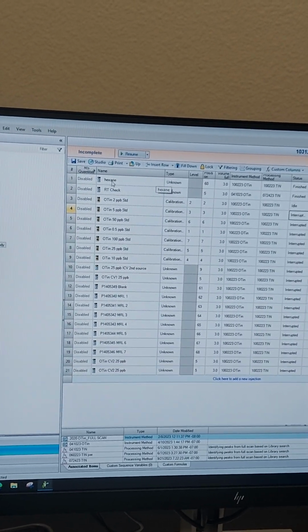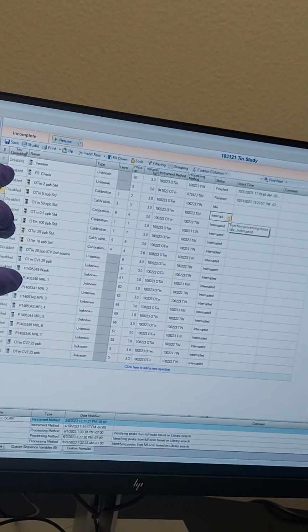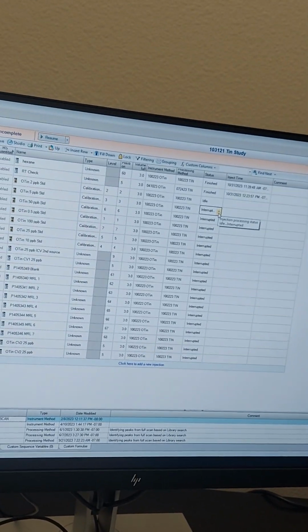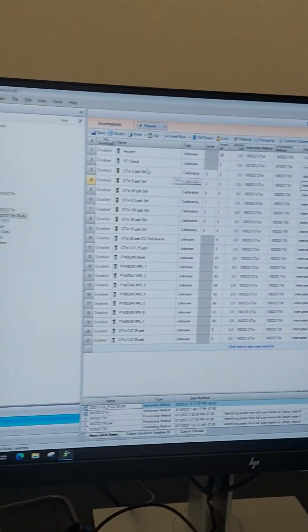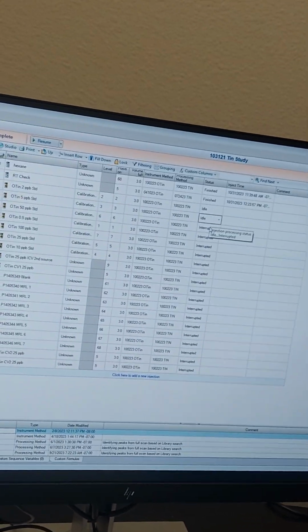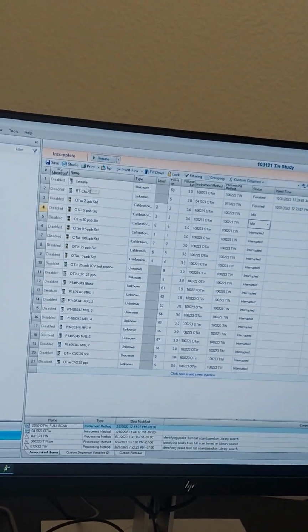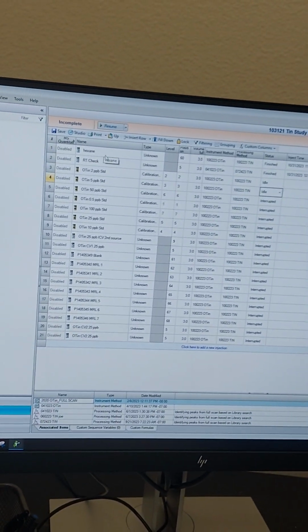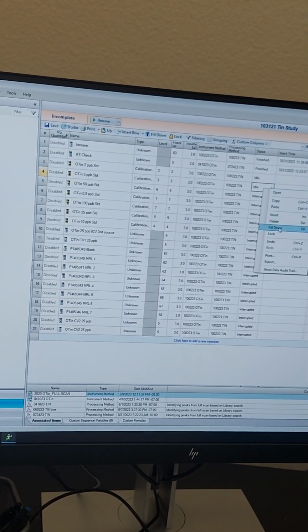You don't need to do maintenance every time. You need a curve every time you save it for the batch. These two rows, do you need to have them in this batch, or can you delete them? You can leave them there. You don't need to turn in data for it or anything. It's fine how it is.